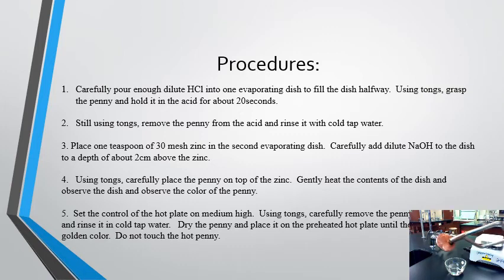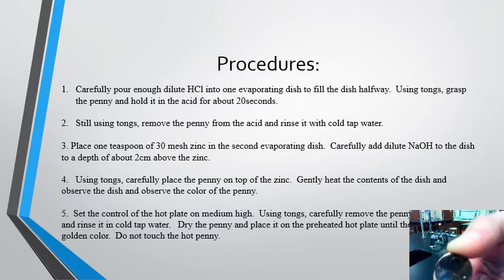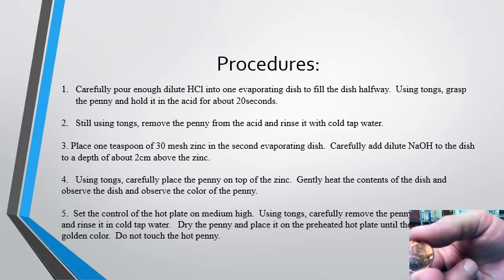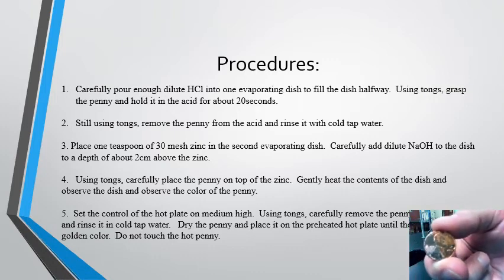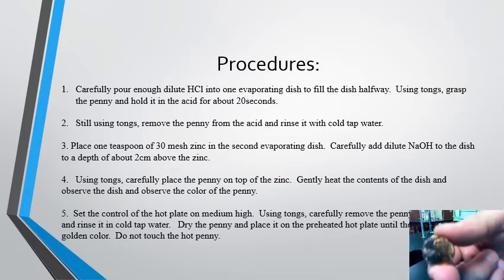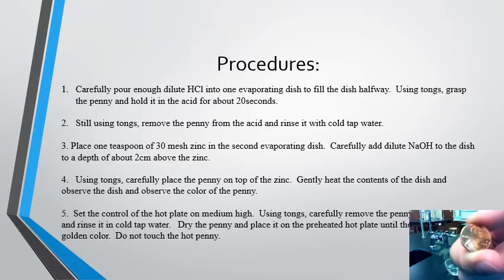And then hopefully you can see here when I hold it up. I don't know if you guys will be able to see it very well, but I should be able to have a difference in the appearance of the penny. You can see the side that I had in the hydrochloric acid, away from the tongs here on this far side. That is the portion that is going to be more cleaned off. And then you have the other portion that still looks more like the dirty reddish color.